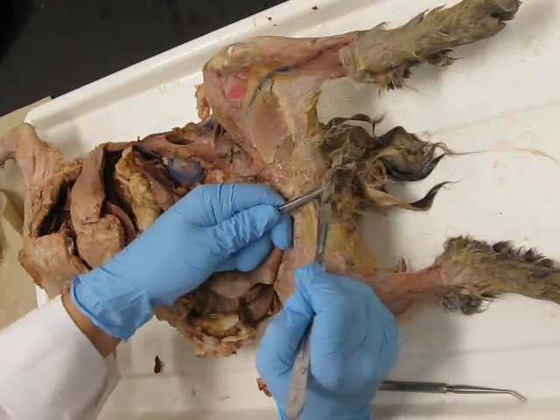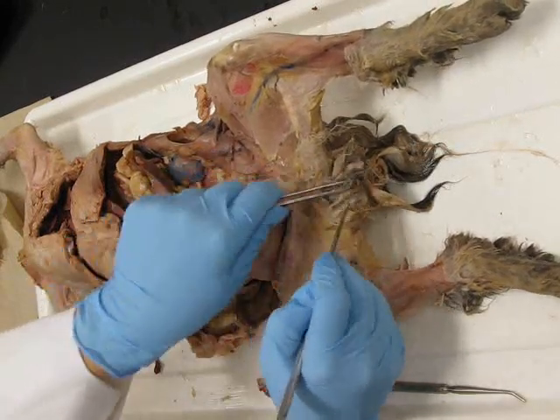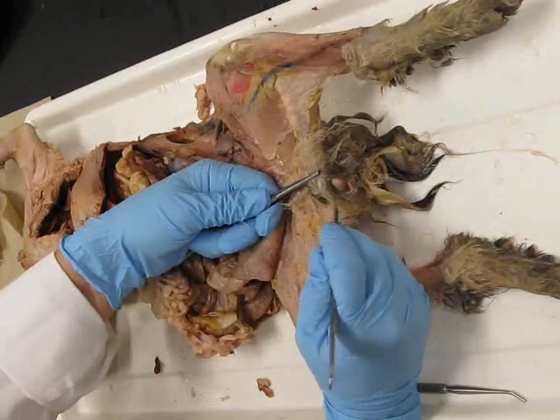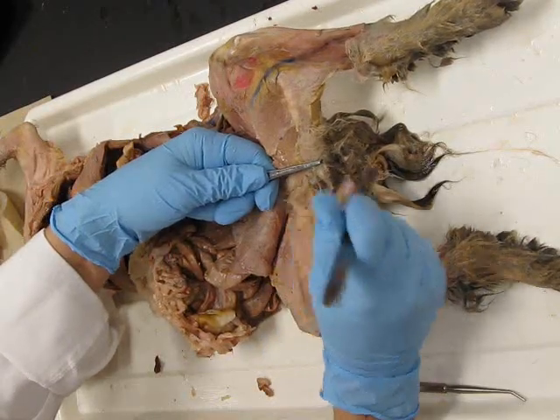We made an incision along the scrotum, careful not to cut the testis inside. Okay, and then we removed the fascia from around the testis so that it was no longer attached to the inside of the scrotum wall.